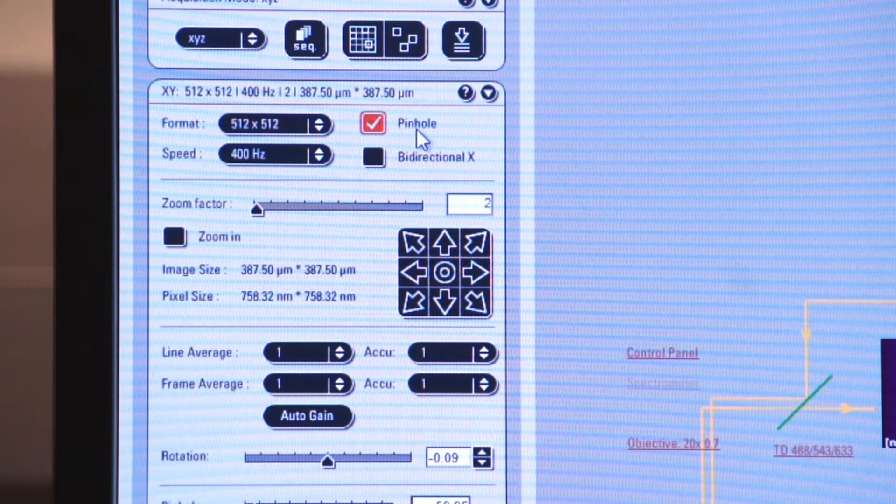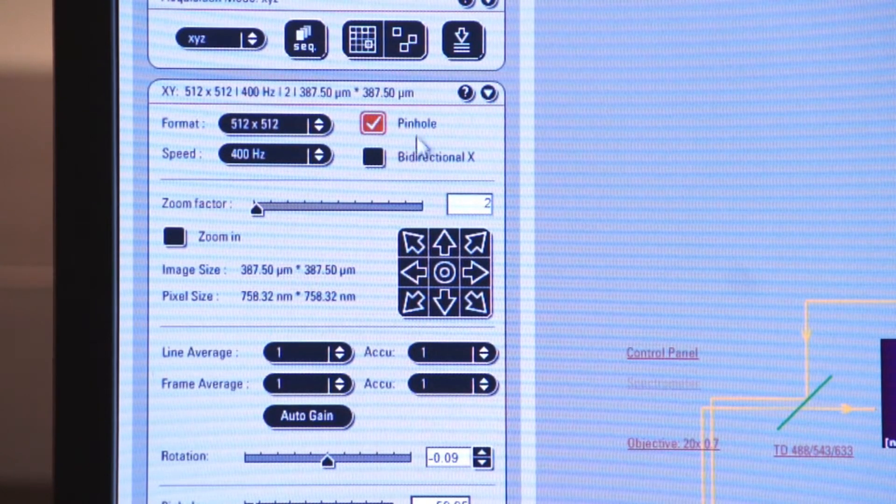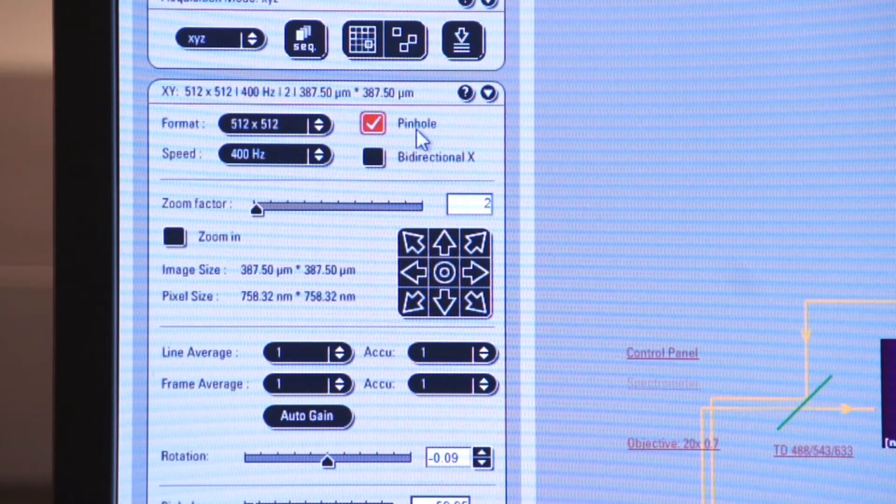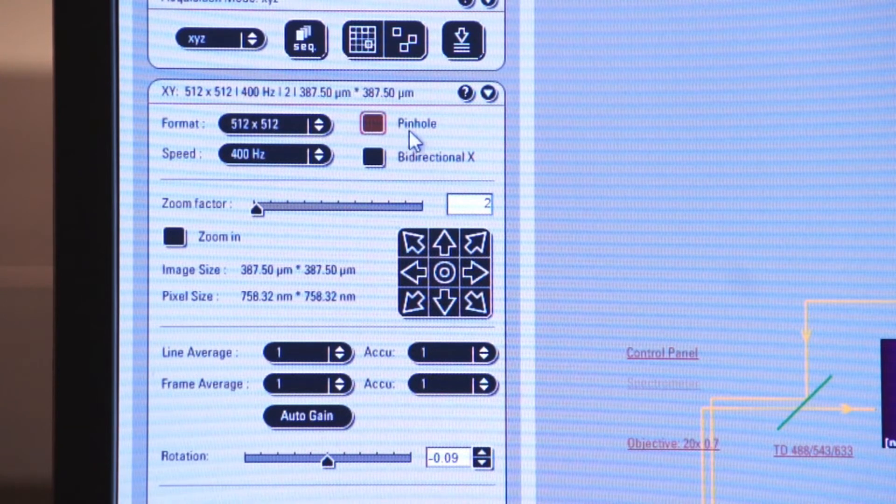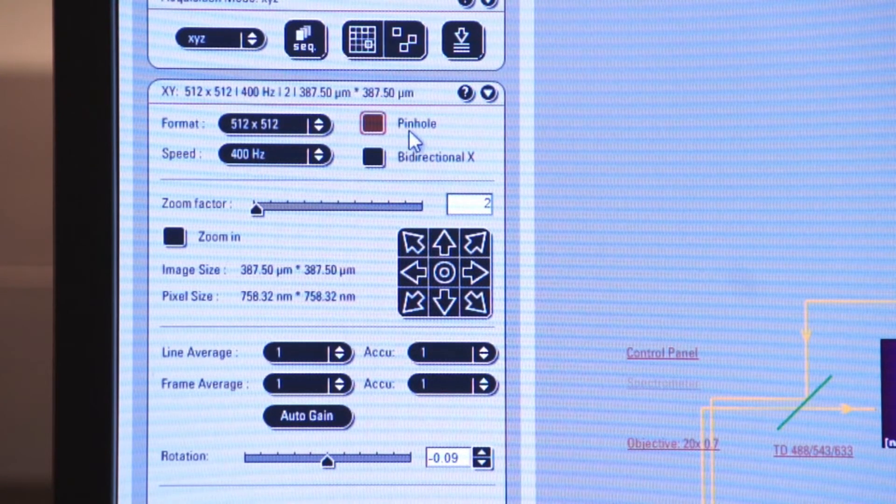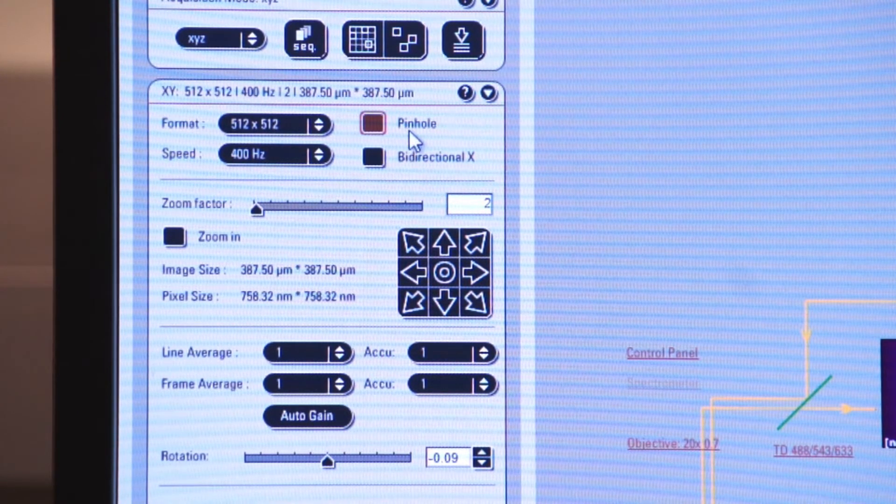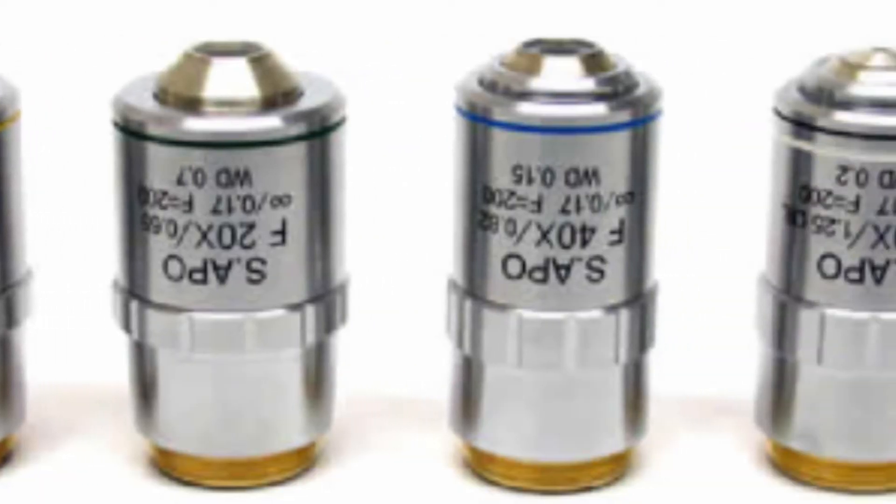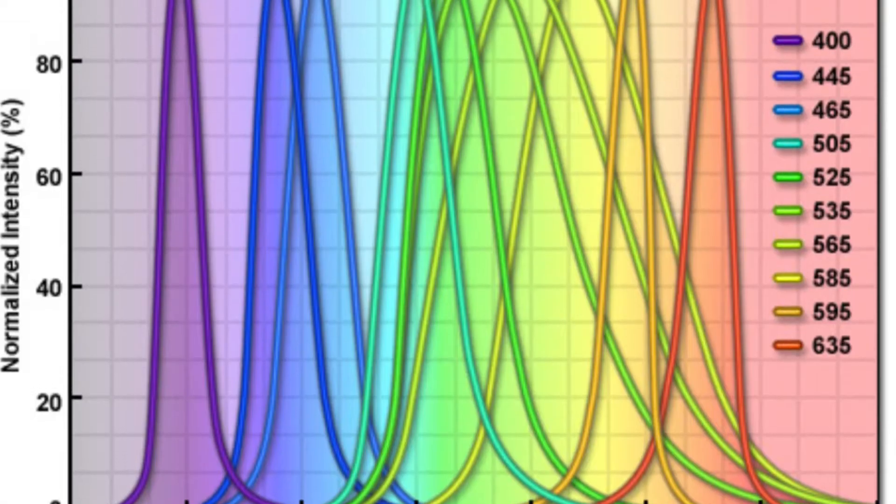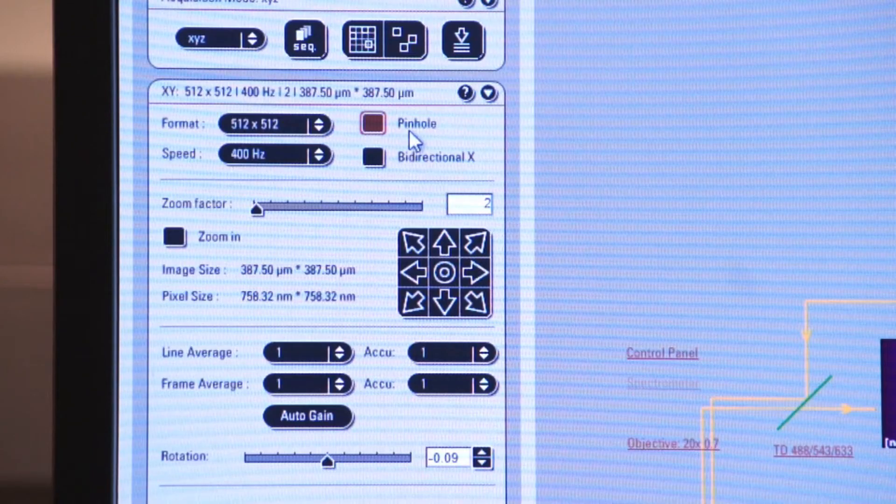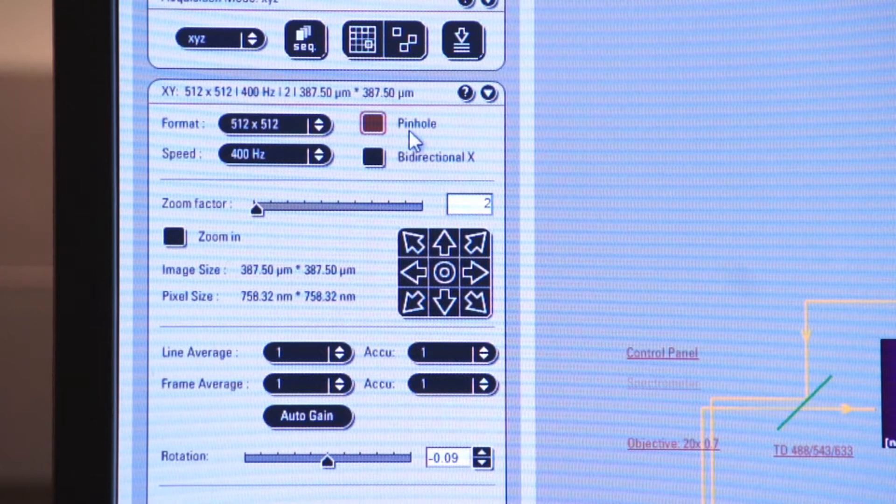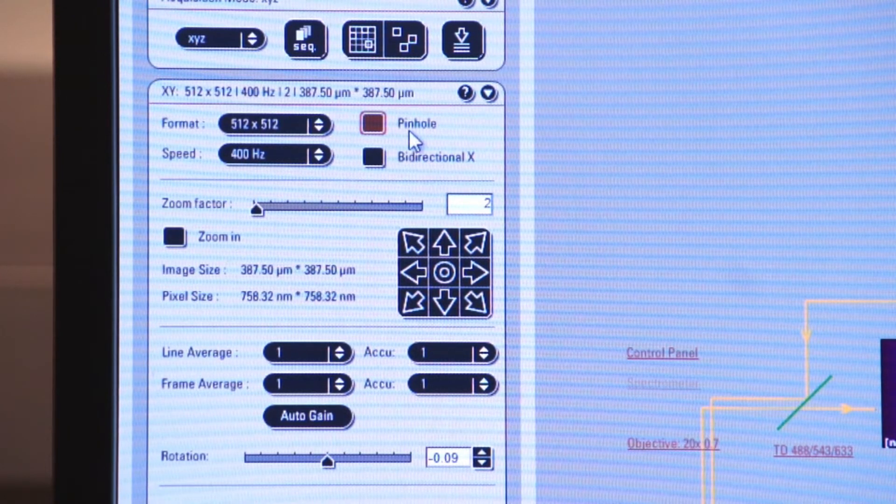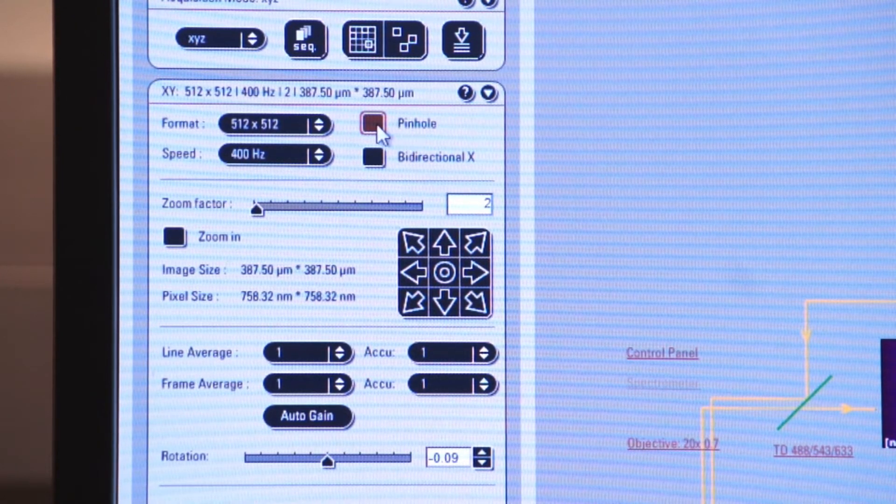The system is always defaulting to a standard pinhole that gives optimum results for the objective used, the fluorophores used, et cetera. But as is everything else in this software, the pinhole can be manipulated.